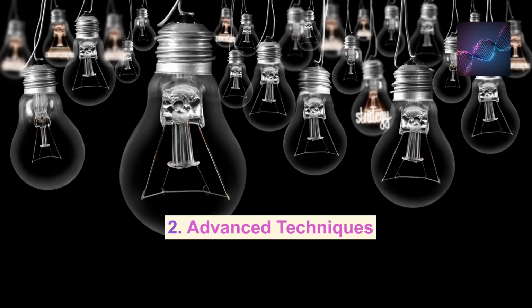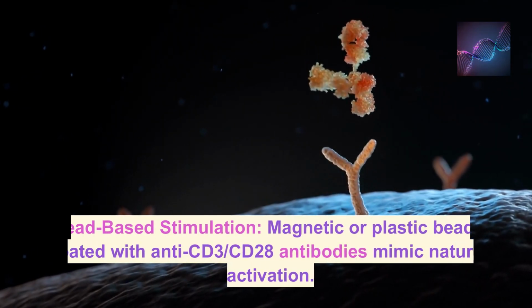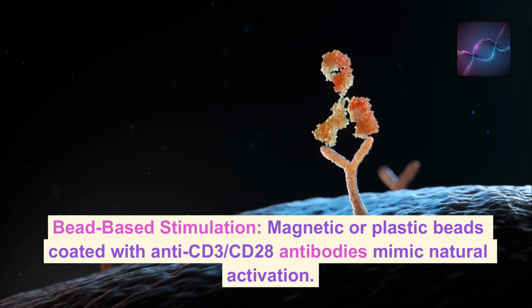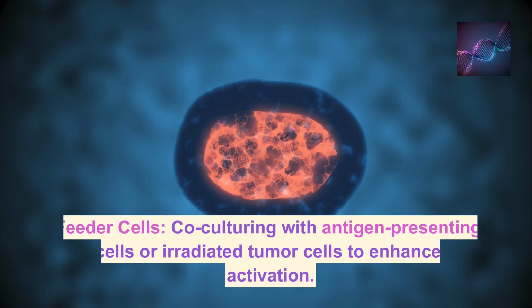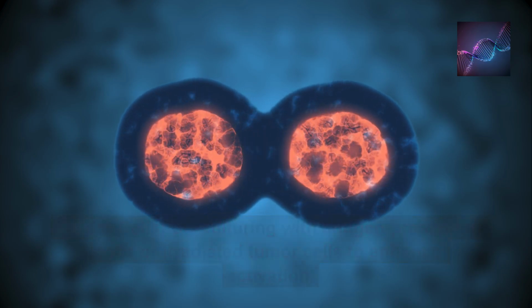2. Advanced techniques, bead-based stimulation. Magnetic or plastic beads coated with anti-CD3, CD28 antibodies mimic natural activation. Feeder cells, co-culturing with antigen-presenting cells or irradiated tumor cells to enhance activation.